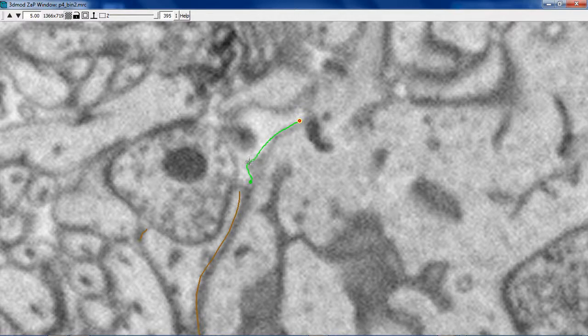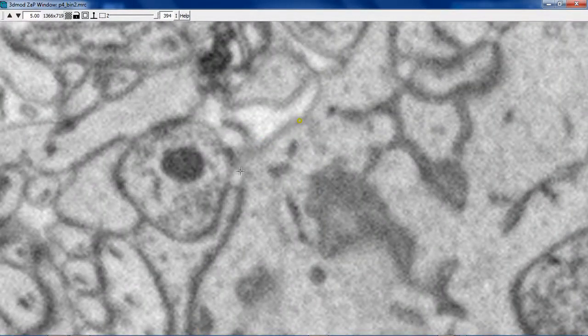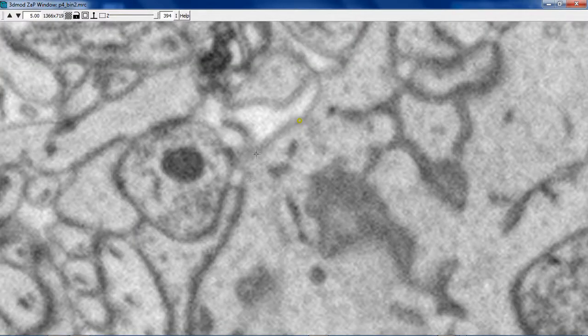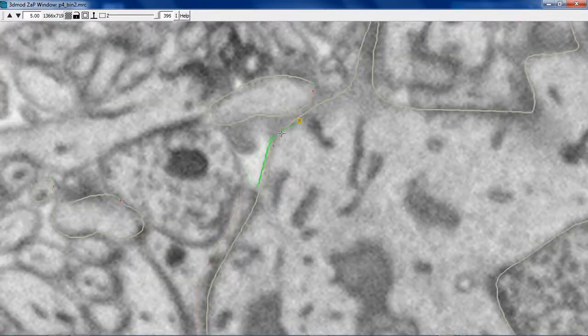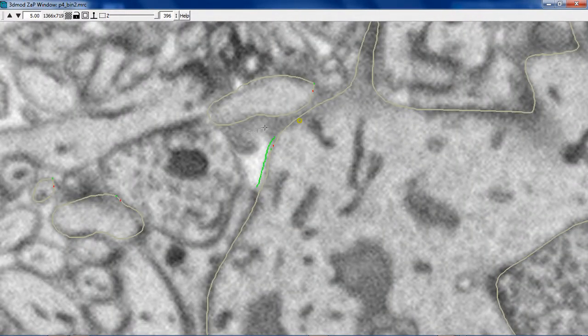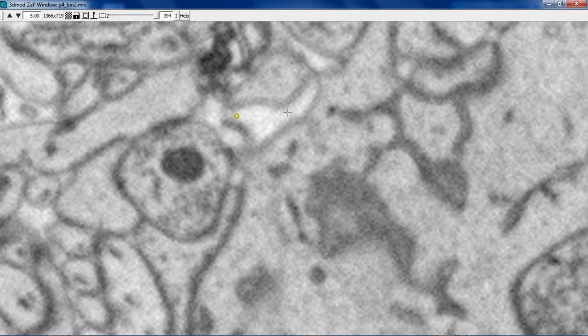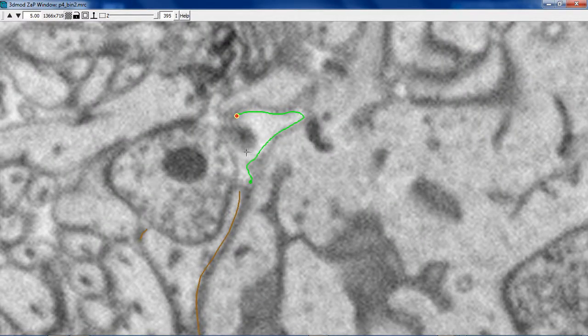Surfaces are important in that they tell iMod what should and shouldn't be connected. So for instance, here when this breaks, you don't want this piece connected over to this piece in any way. So you have to make a surface here and a surface here. We'll also need to go back and make a surface here for this piece. We can go ahead and just bring this around for right now. There we go. Alright.